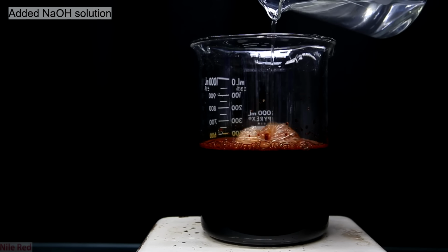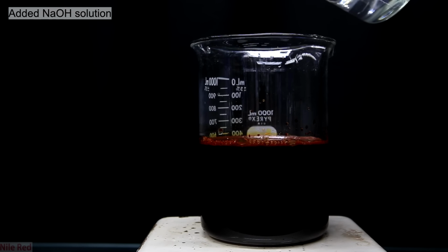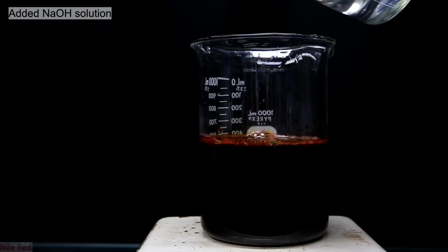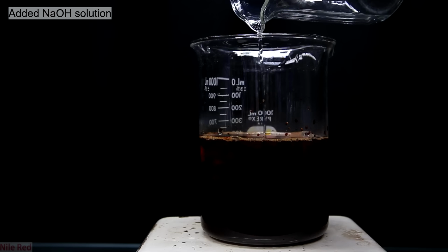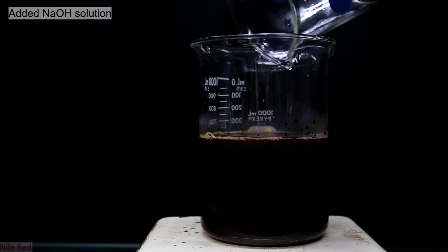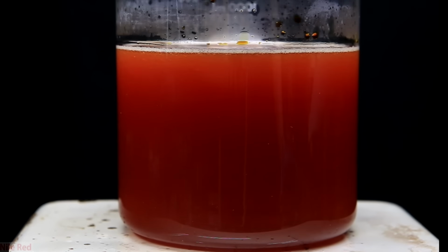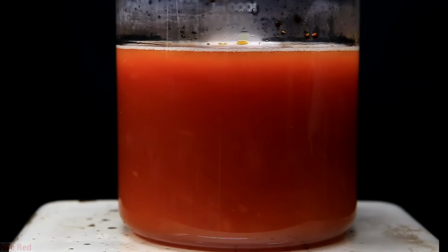So now with strong stirring, I start to add the sodium hydroxide solution that we made before. You can see that after it's added, some solid stuff is floating around. In this shot, I'm adding the sodium hydroxide solution that I originally made, which used 30 grams. However, even though I calculated this to be enough, it didn't seem to be. This is why I said you should have at least something like 100 grams on hand, just in case you need to make more sodium hydroxide solution. So that's what I ended up doing, and I dissolved 30 grams of sodium hydroxide in another 75 milliliters.